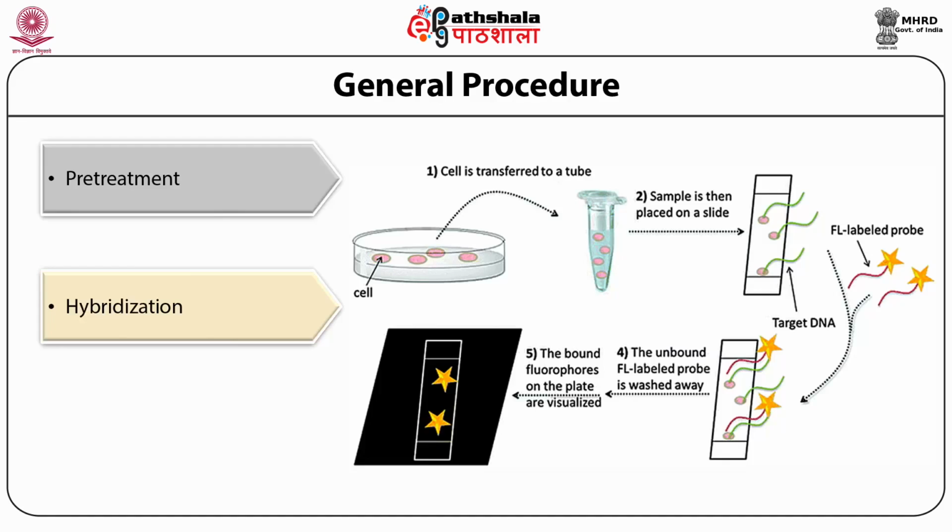Post-hybridization washes with RNase can then be done to hydrolyze the unhybridized probe, which can then be washed away. Increased stringency results in increased specificity and lower background signal. Non-specific reactions can also be reduced by manipulating the reaction parameters like temperature, pH, salt concentration, etc.